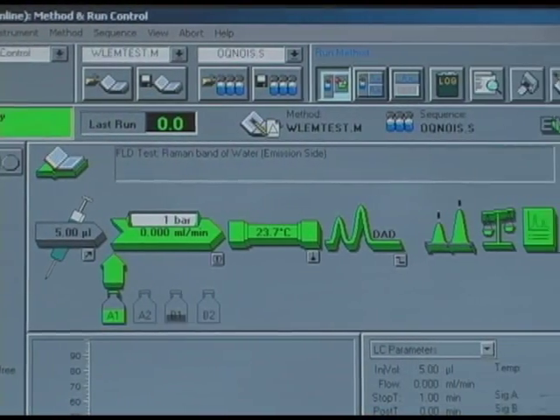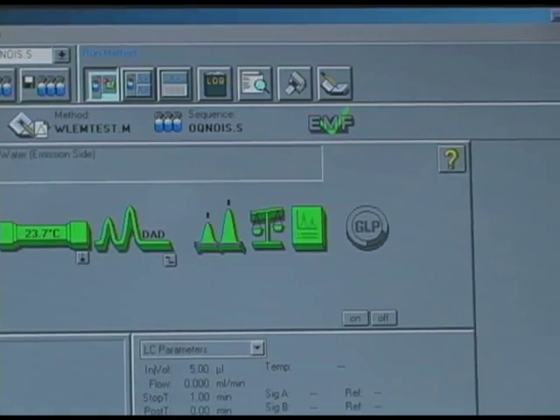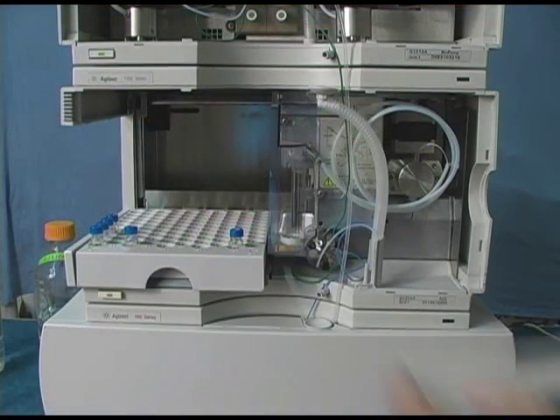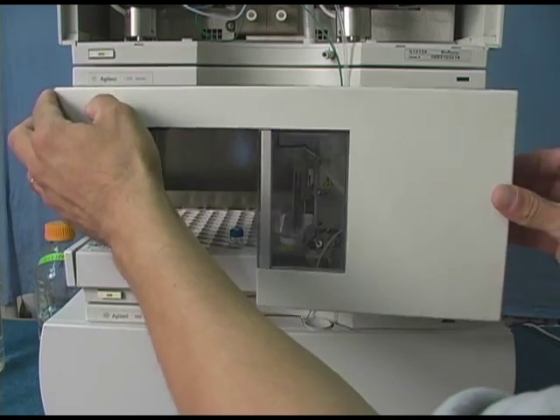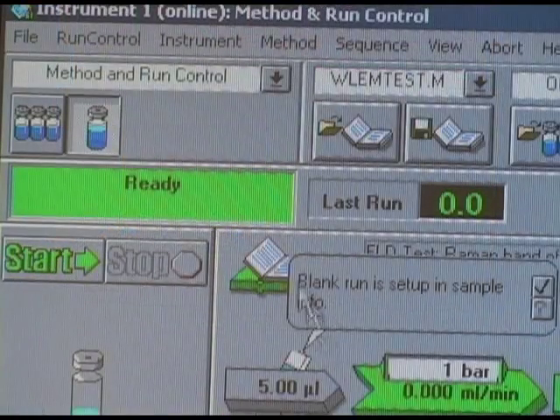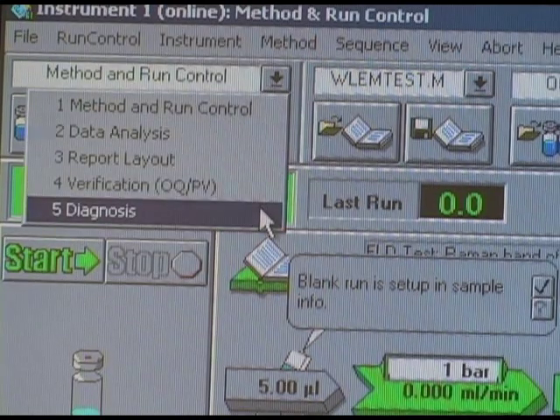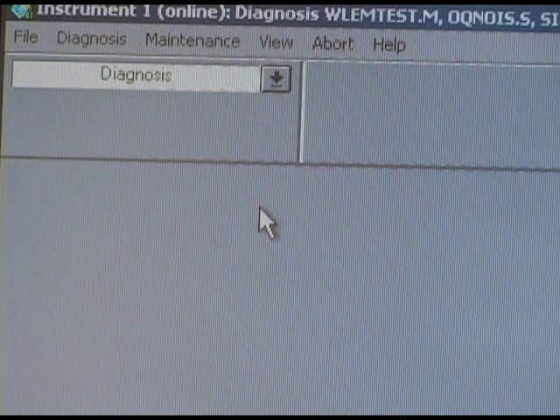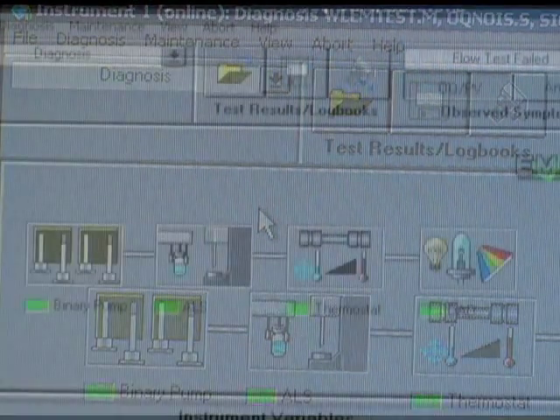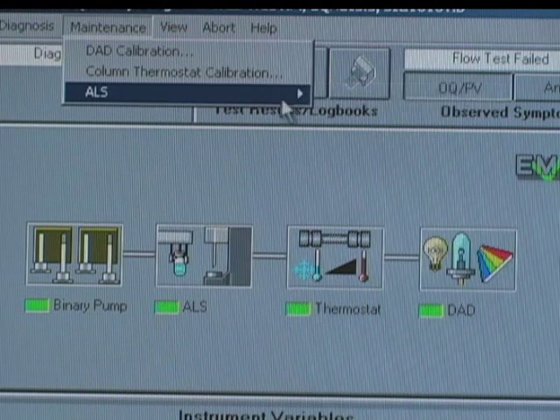We're going to assume that most users are working with Agilent's ChemStation software to control their systems. Before proceeding, if you haven't already done so, make sure that the front cover is installed on the Auto Sampler. Now that you have the front cover installed, go to the Diagnostics Display View in ChemStation. You're then going to click on the Maintenance Pulldown menu and select ALS Maintenance Position.